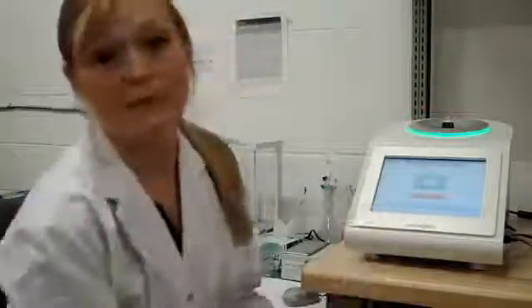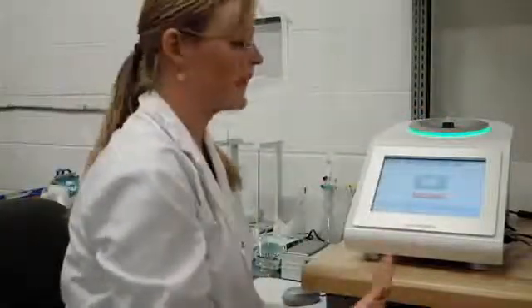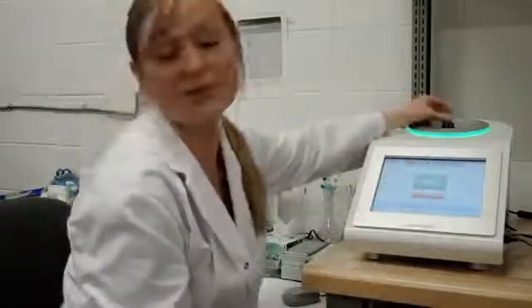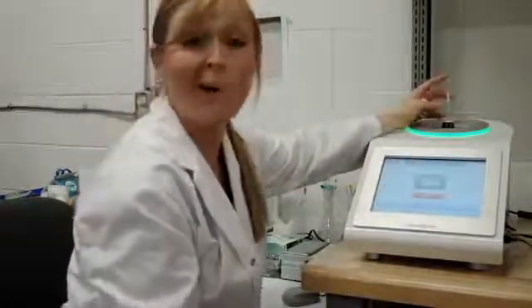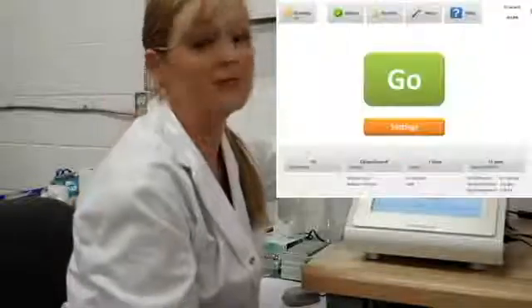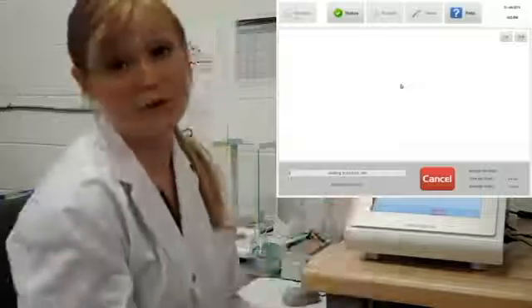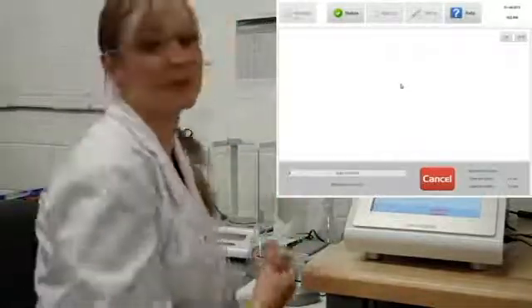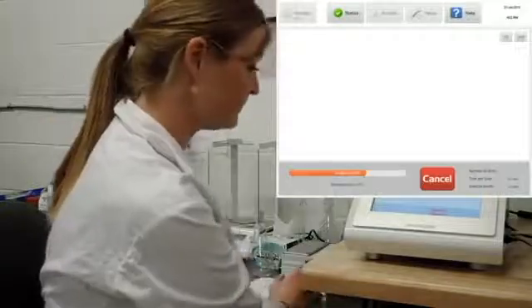The NMR spectrometer comes with pretty standard acquisition parameters preset. So once you put the sample in, no need for the use of air or depth gauges. You can put the sample in until you feel it click, and then you hit go. Typically I would use the touch screen as I just showed you, but to make this a little bit easier to see, I'm going to use a mouse for the rest of my processing.